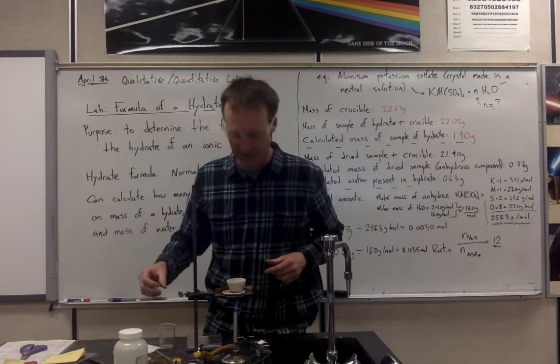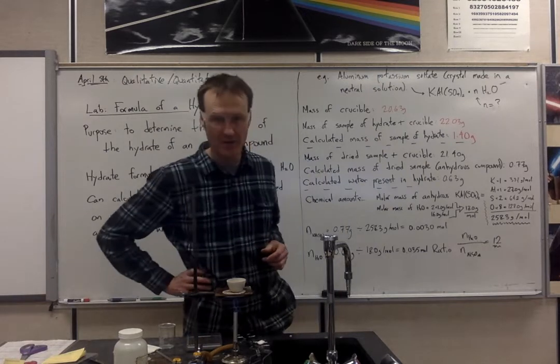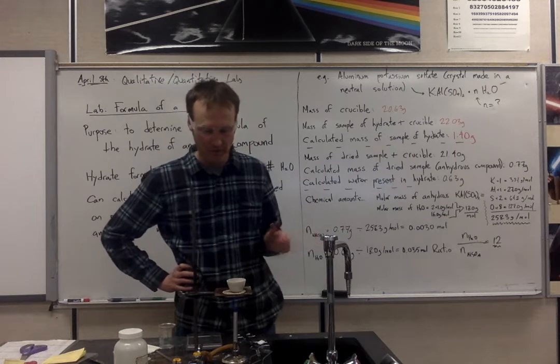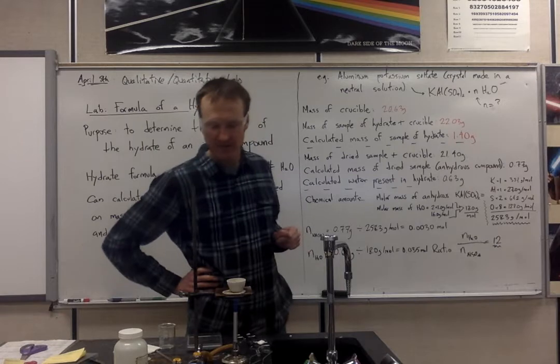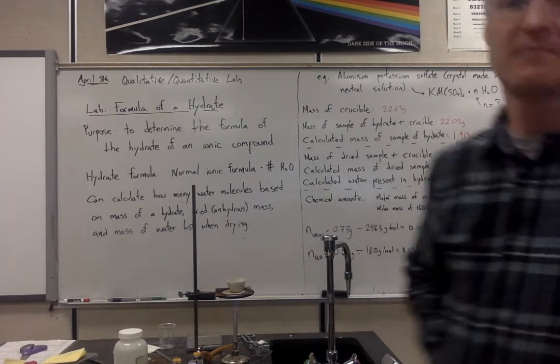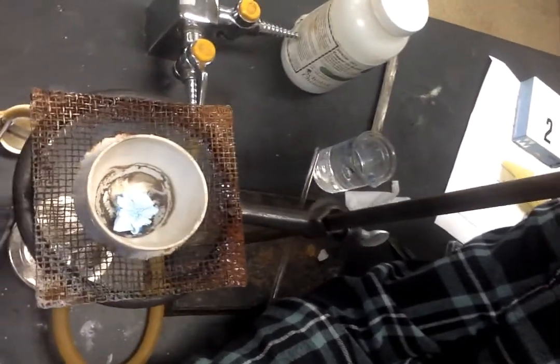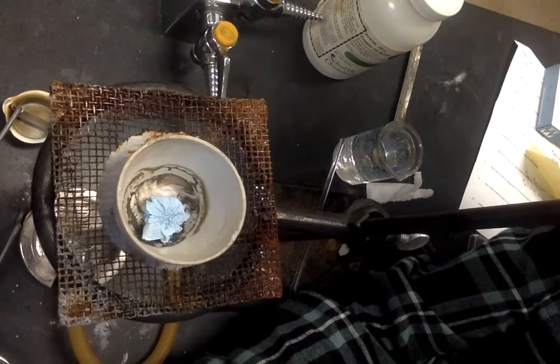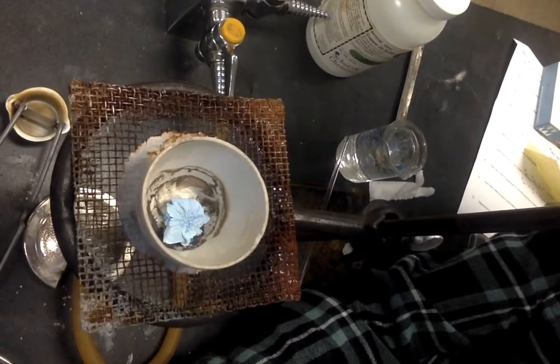And it is not happening. That is one big crystal. But the color is changing, which is exactly what we're looking for. I'll get the camera focused on the crystal. So we're starting to see a color change right there. Color change is something that you should also be taking note of for the purposes of this lab.